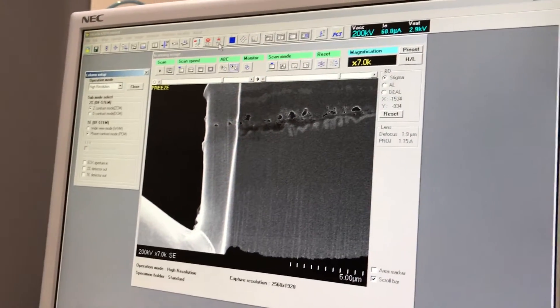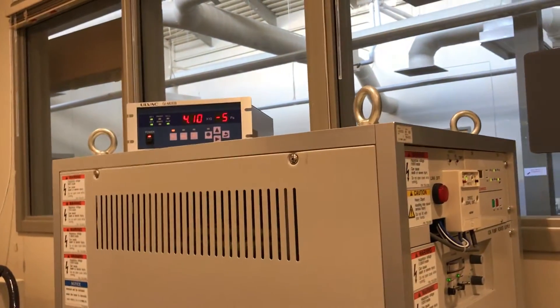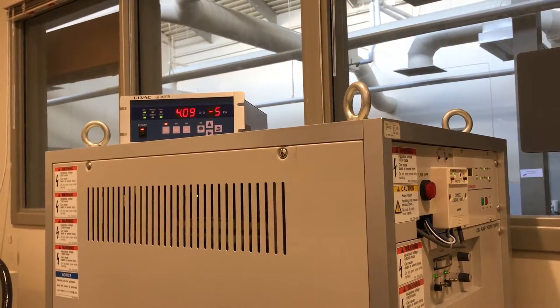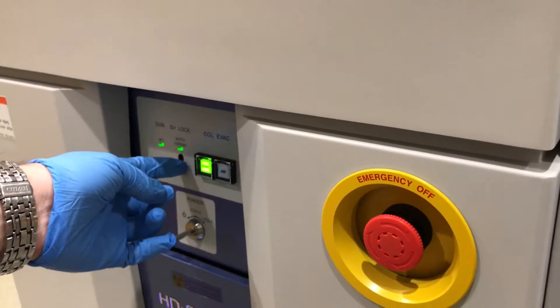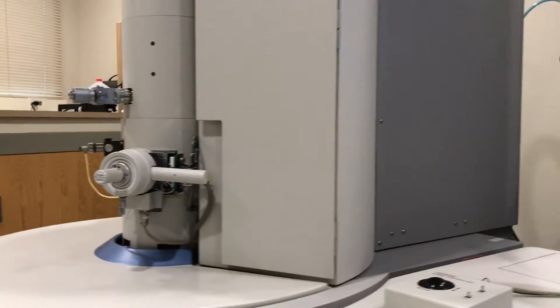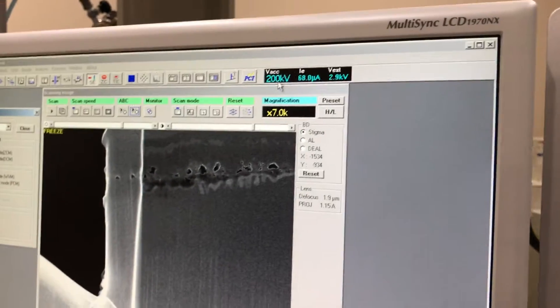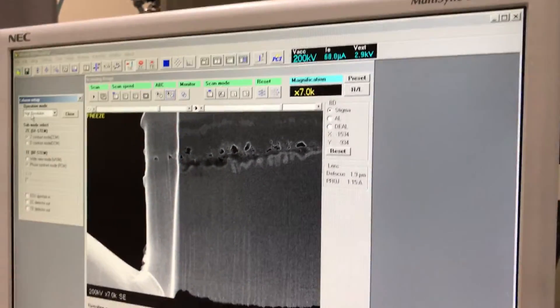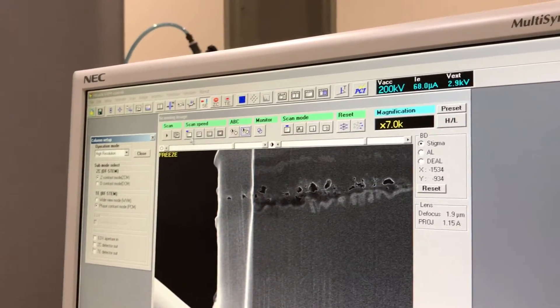I can see the pressure is now past 5 × 10⁻⁵, so it's time to turn on the gun lock. I can turn the gun lock to the open position — so it's open. My beam voltage is 200 kV. I have to choose high resolution operation mode.